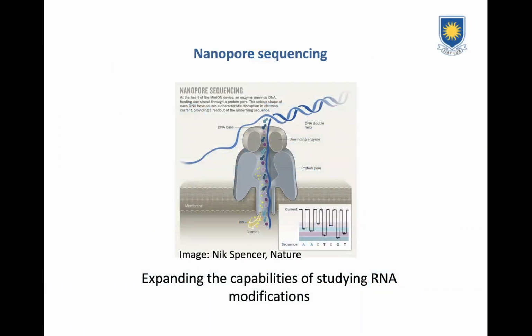For this audience, I think providing many details regarding nanopore sequencing may be redundant. Nanopore sequencing does offer long-read RNA sequencing, but one specific property that has received particular attention during the recent years is the potential, theoretically, to identify RNA modifications on the RNA strand.